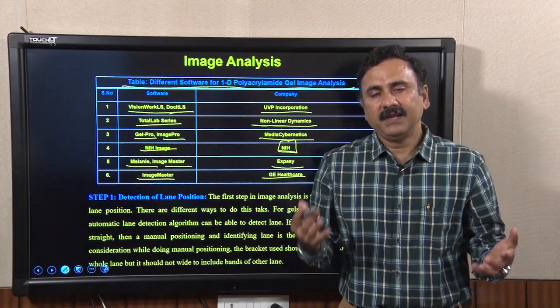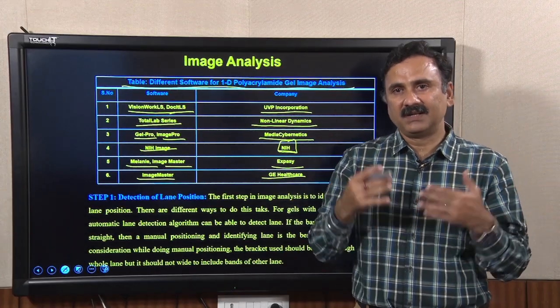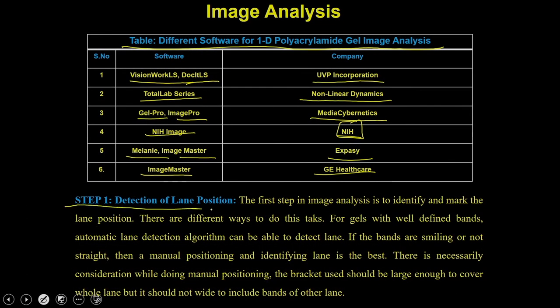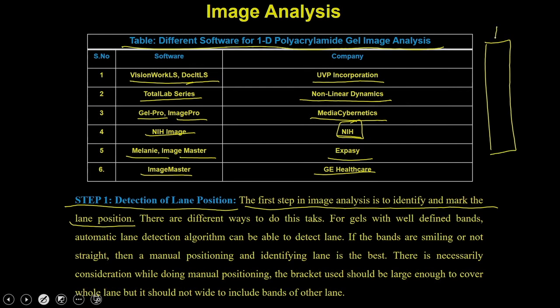Now to analyze an image, we have discrete steps. So what is there in step 1? In step 1, you first have to detect the lane positions, the lanes in which you are interested to do all the image analysis operations. So in the first step, you have to identify and mark the lane positions, which means if you have a lane, you first mark the lane that you want to analyze, this particular protein lane. There are different ways to do this.